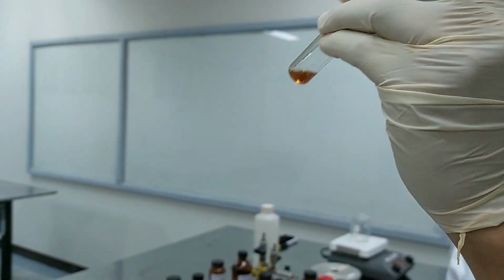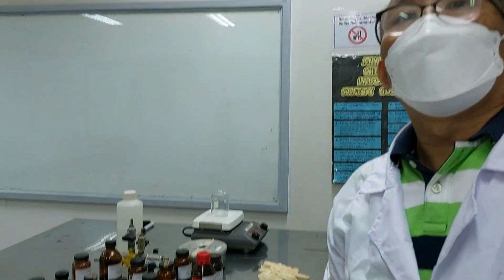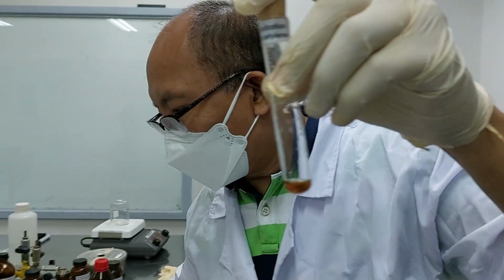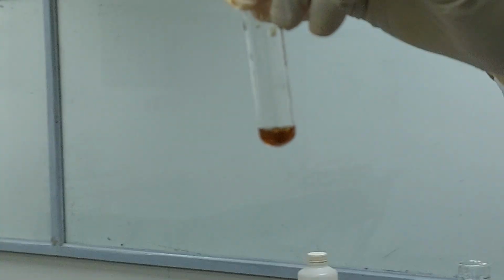Compare that to, if you have a lot of acetylene, you will observe chocolate brown. No? There is also this. There is already a change, no? If you compare that with this, you see that brown? That's positive already. See, it's chocolate brown.